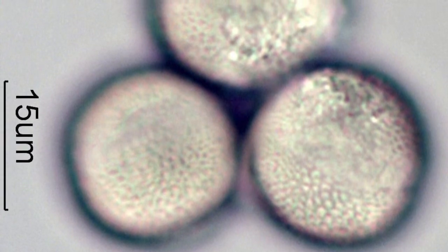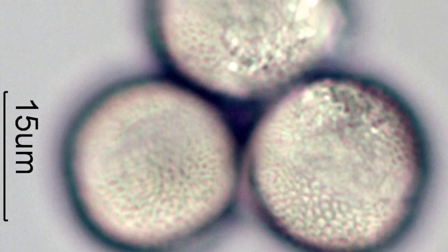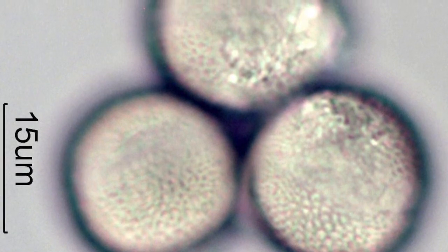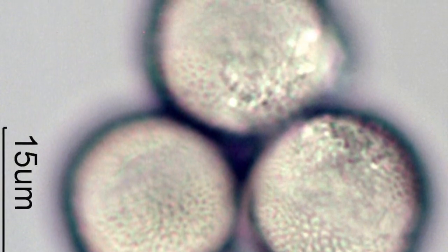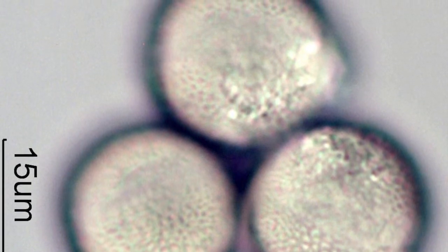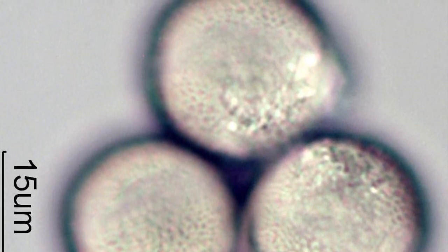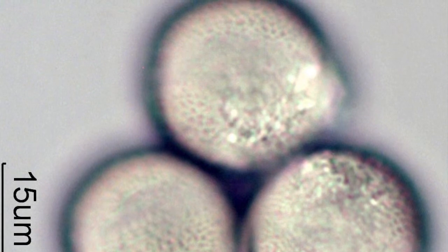Now as we look at the pollen grains, we can see this net-like structure over the surface of the grain. That's called a reticulate pattern. So this is a reticulated pollen grain. Notice also that the grains are very circular in structure. These grains are actually spherical.